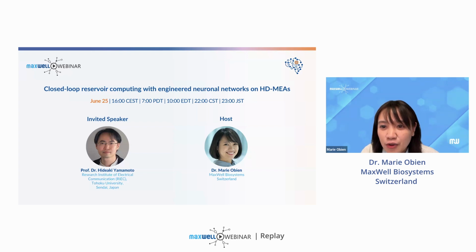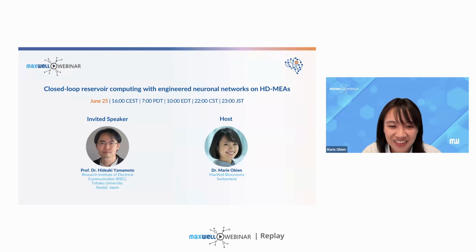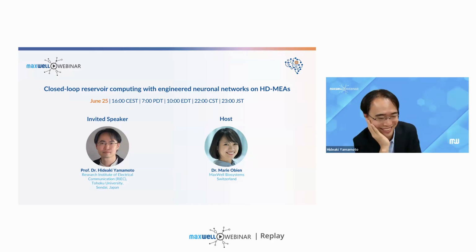Okay, next, we have Michael again. Would the neurons be dislodged from their intended electrode position if the HDMEA were to be bumped or jostled around beyond the standard lab environment conditions? I guess if you move around the chip, will the cells move around as well? Was the question.